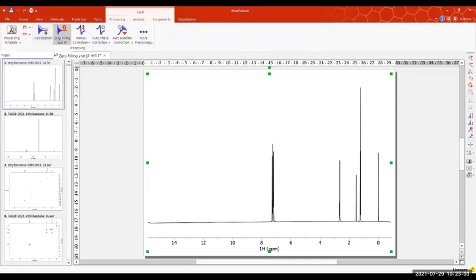So most of the time, you don't need to check those. For 1D NMR experiments, you can go to phase correction. MNOVA can do manual correction or auto correction for you. So we will do auto correction first for those 1D protons, and then in the carbon-13 spectrum, I'll show you how to do it manually.